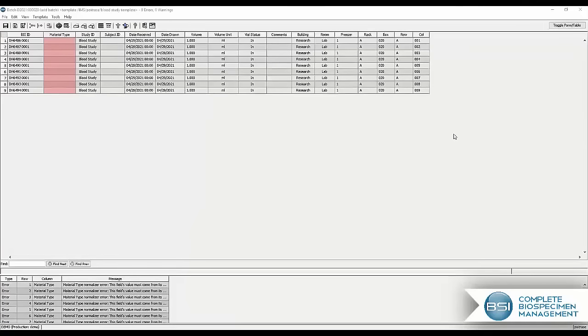This opens up a data entry batch, which is where you can enter your specimen data. Each row in this table is a unique specimen, and each column here represents a different data point that is being tracked. You can see here that some values are already filled out. This is for two reasons. One, we selected certain spaces within the Locations Manager, so these are already assigned. And two, I have applied a data entry template.